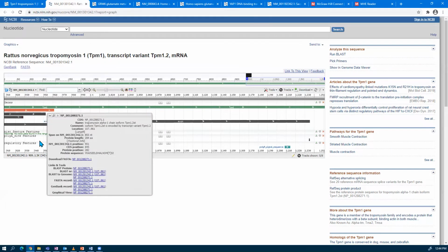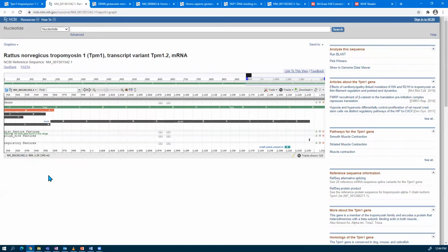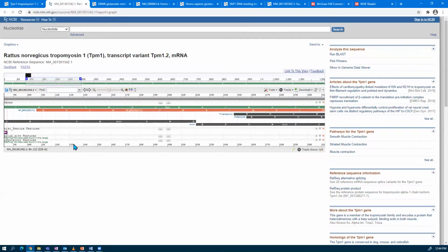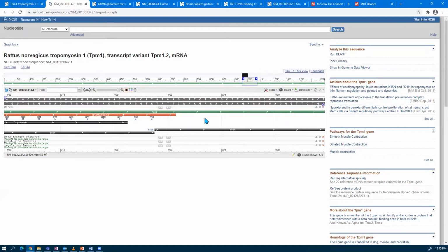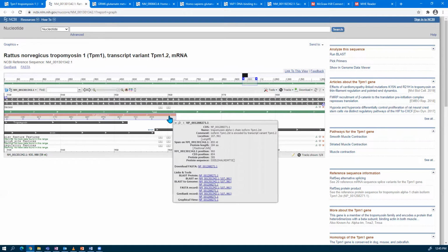at, now you'll notice because I didn't zoom in quite far enough, I can't actually see the nucleotide sequence. So if that's the case, zoom in a little bit further. And for now, I'm not going to worry about the rest of the 3' untranslated region. I'm just going to focus on the end of the protein sequence. Oopsies. So I'm going to zoom back out. Let me start again here. So I want to zoom into this region right here at the end. There we go, the tail end of the protein sequence right there.